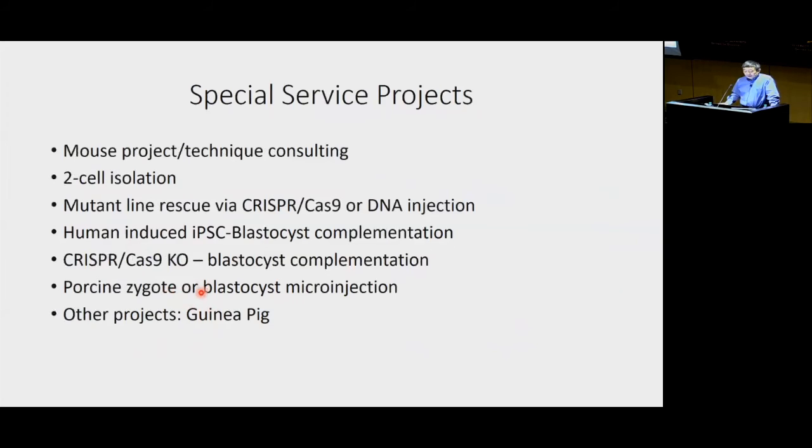In the past, I tried some porcine pig zygote injection, but so far no one has asked after that lab, so we didn't do it, because the pig is a much bigger project that takes longer time and involves some other labs, I think.